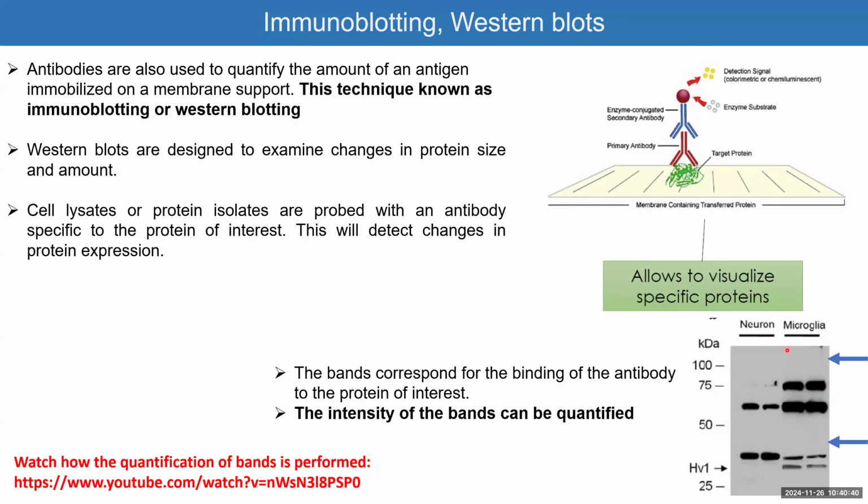This Western blot clearly tells you, so the researchers normally, when they present this in a paper, they cut out the molecular weight marker. I don't know why they do that, but most people do that. And then they post these numbers. So these are the references of the molecular weight. So that's the area where you can see 100 kilodalton. If this is, it's 75. If it's between these two, it's around 60 something. If it's between these two, it's around 30 something. So it's a correlation, not very accurate.